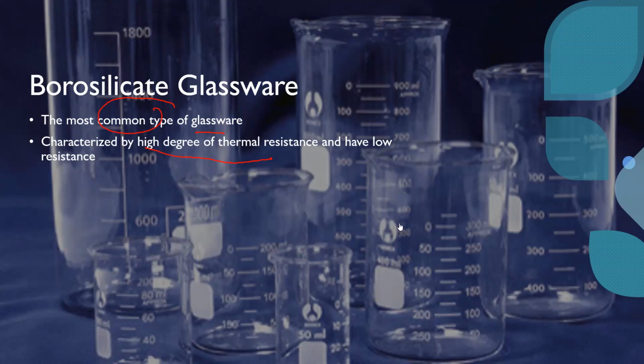For example, the Pyrex beaker that we use. In the laboratory, you've been using the Pyrex beaker a lot of times. Have you seen a beaker break because of high temperature? Sometimes, yes, if it is too old.